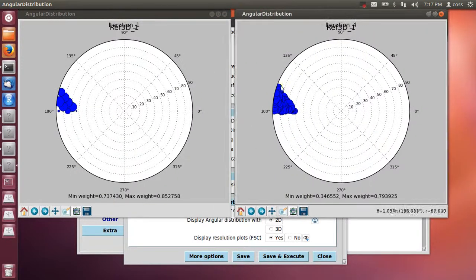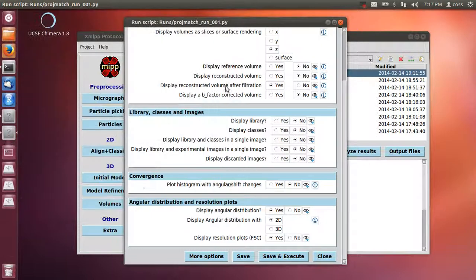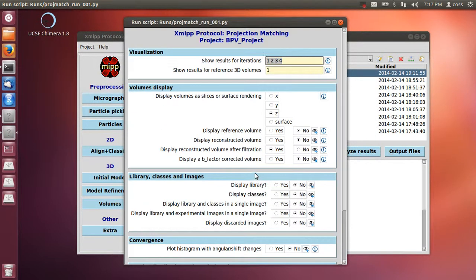What you see is that the coarse assignment at the beginning, mostly in 10 directions, is now much finer, and we are assigning in many more directions. So we have a good angular coverage.